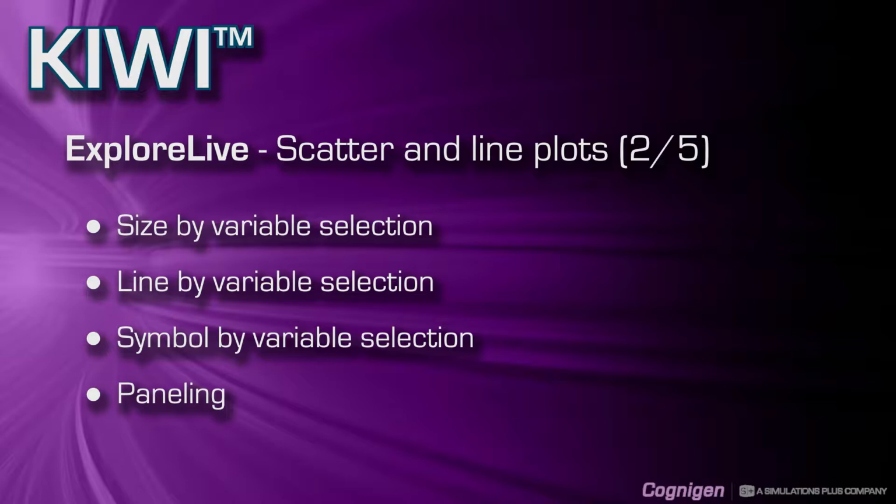We'll start by talking about the selection of a size by variable. Then we'll talk about the selection of a line by variable or a symbol by variable. And finally, I will cover the functionality of data paneling.